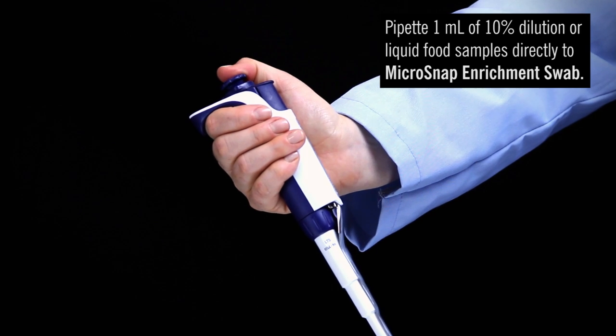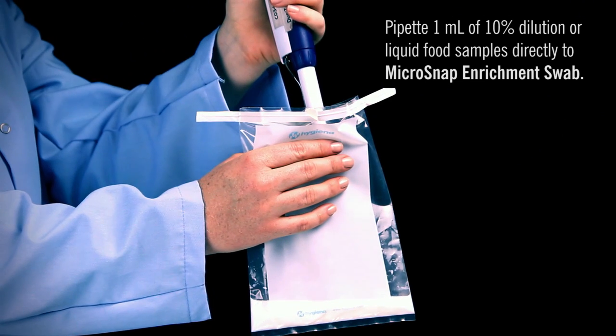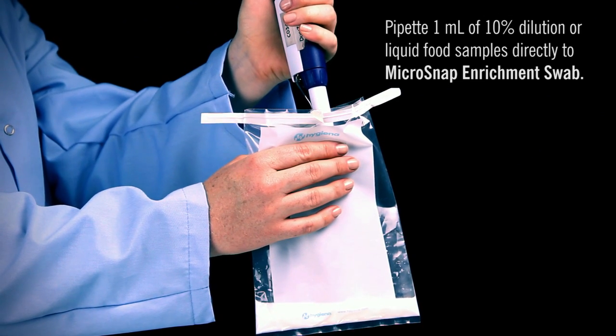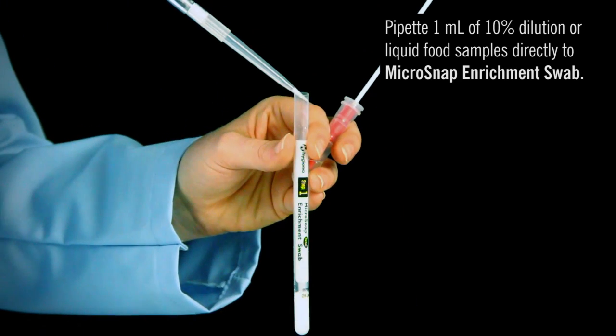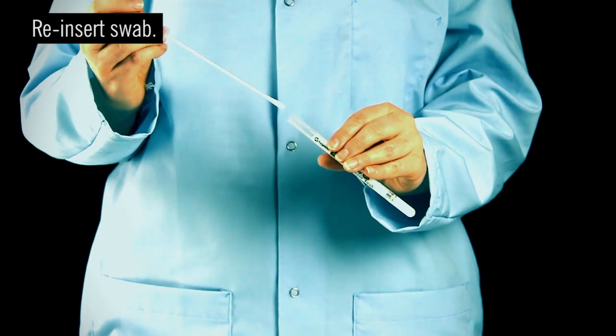For product samples, you may prepare a 10% dilution or add 1 ml of liquid food samples directly to the enrichment device. Replace the swab in the tube.